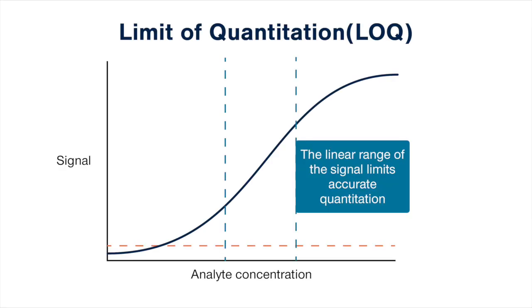And typically those curves are S-shaped. When we talk about the limit of detection, that might be towards the bottom of the S. Whereas the limit of quantitation, we often are really referring to the linear range, whereby if I change the amount of an analyte by X amount, I get a linear response in my estimate of the abundance.